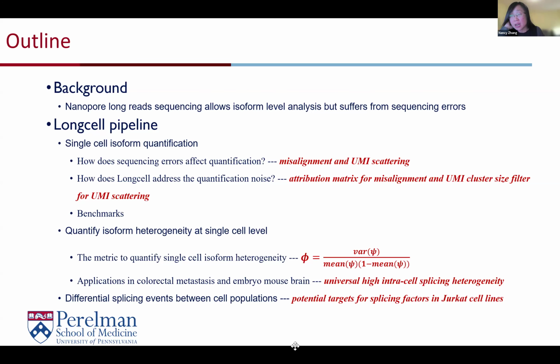So in terms of what is the minimum coverage required, it depends on what gene you're looking at, right? Whether your gene is highly expressed or lowly expressed. If it's lowly expressed, I would say there's no hope unless you do some targeting.